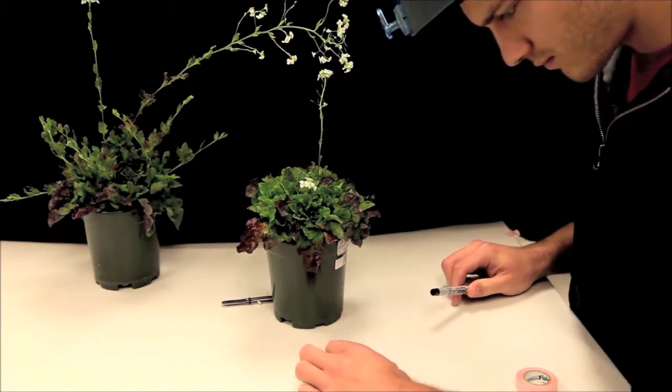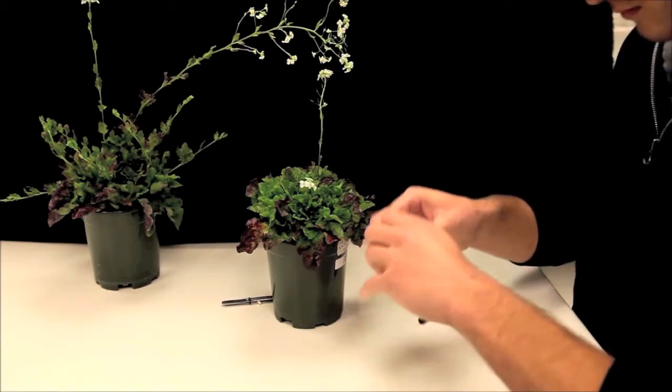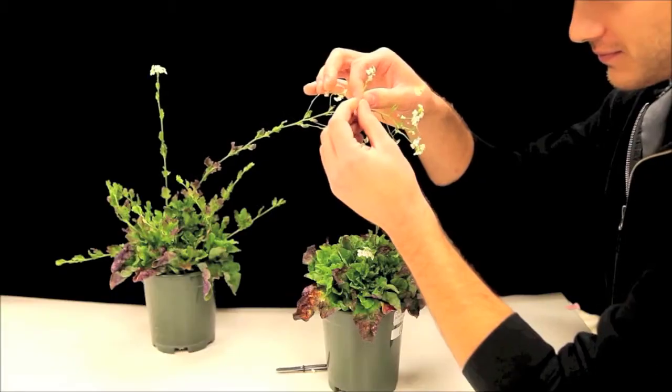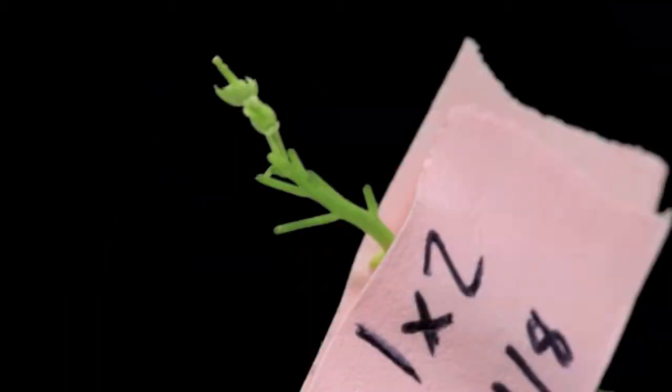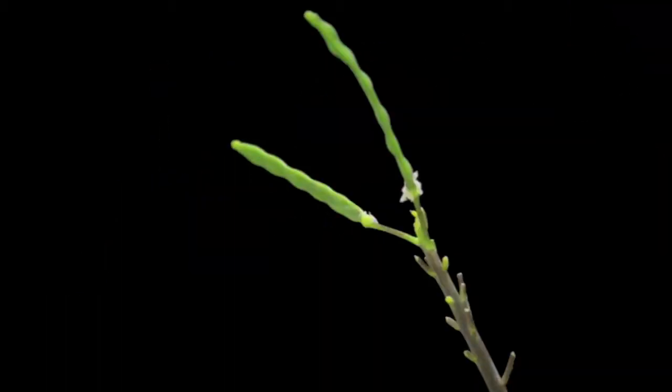Make sure to label your crosses by wrapping a small piece of tape around the flower you just pollinated. This will help you keep track when you come back several days later to confirm that your crosses worked by seeing the formation of siliques.